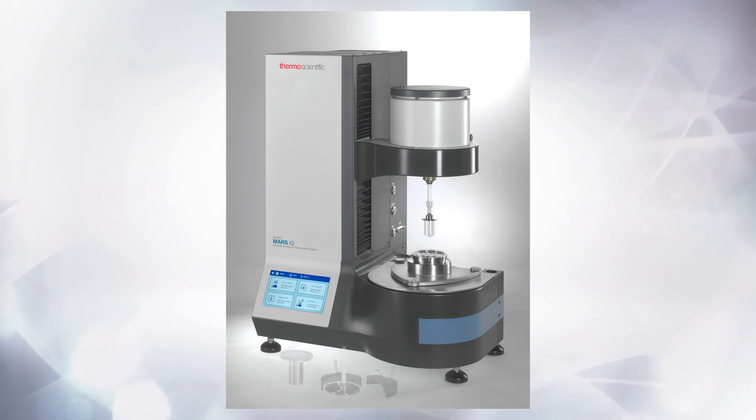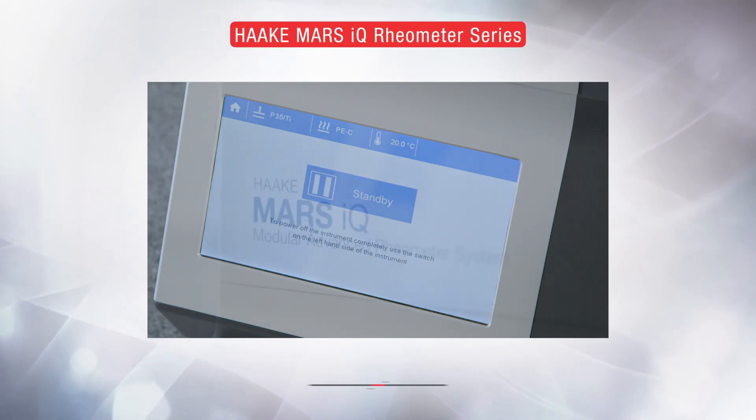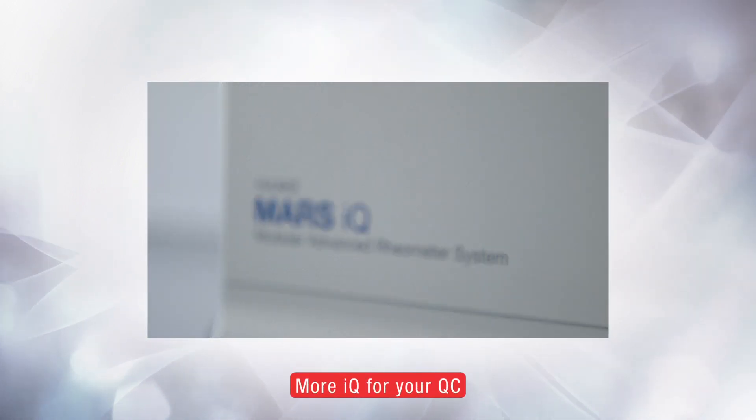Discover the intuitive, intelligent and individualized HAAKE MARS iQ Rheometer Series and get more IQ for your QC.